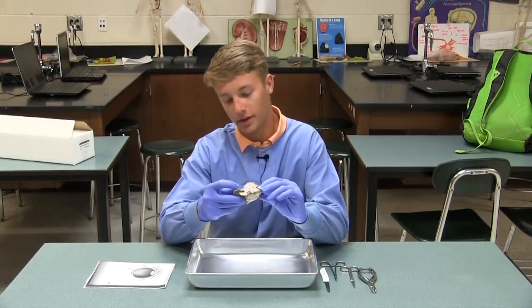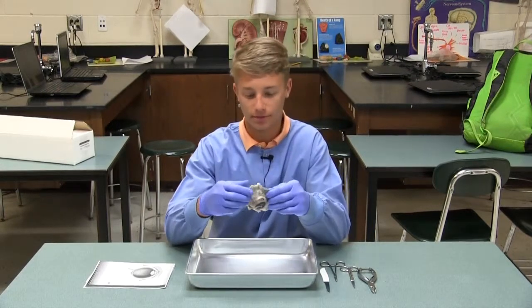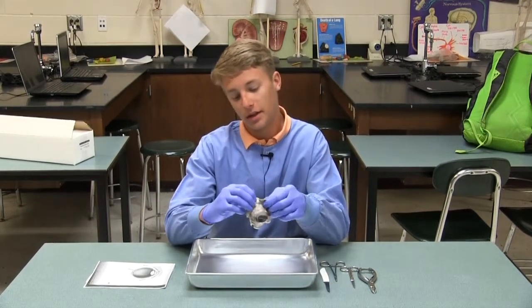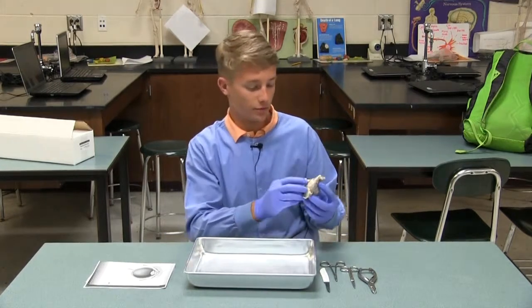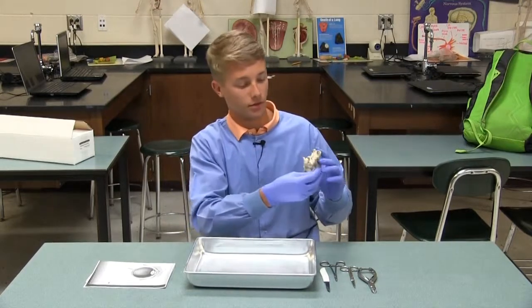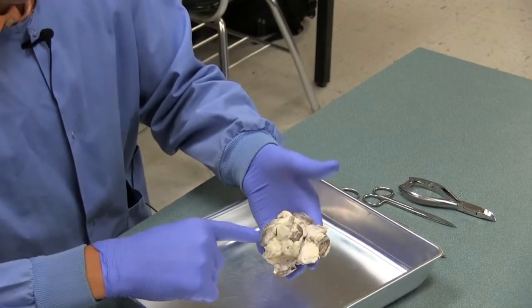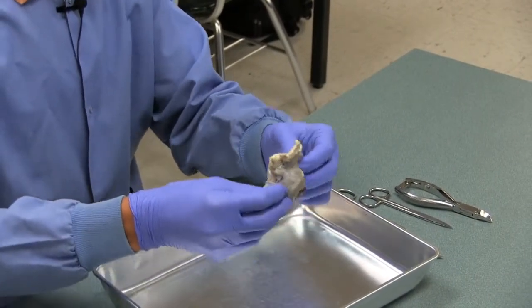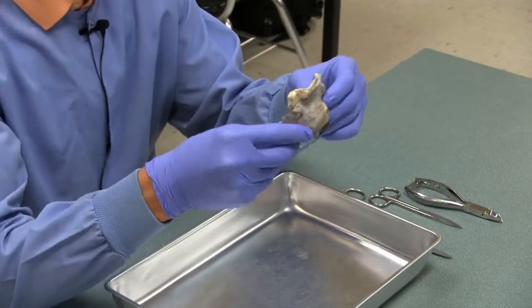First of all, I want to talk a little bit about all this stuff around the outside of this eye. This is all fat and muscle. The cow's eye has four muscles that allow movement up, down, left, and right. And if you look here, you can see the four muscle endings here. Now, opposed to a human eye, we have two extra muscles that allow our eyes to move more freely.